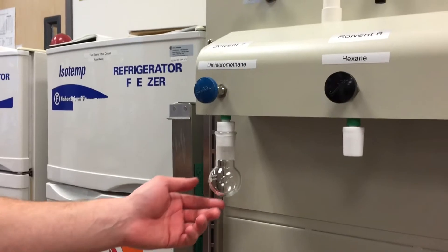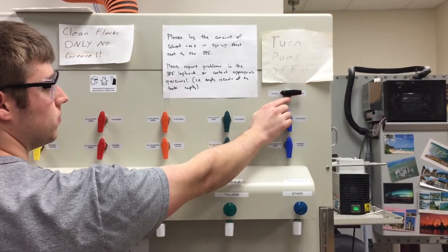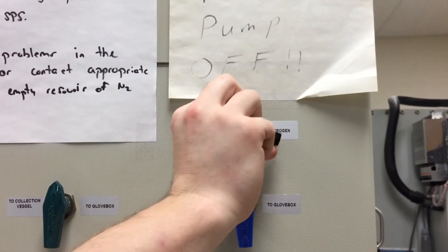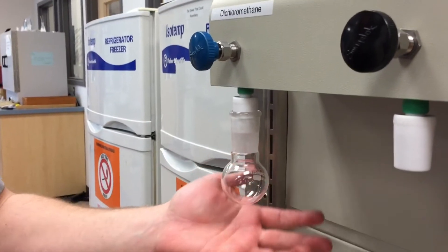This is probably good. Then I'm going to purge the round bottom flask with nitrogen, so I'm going to move this to the right side and then turn it back, put the vacuum back on. This is done to remove any oxygen from the vessel.